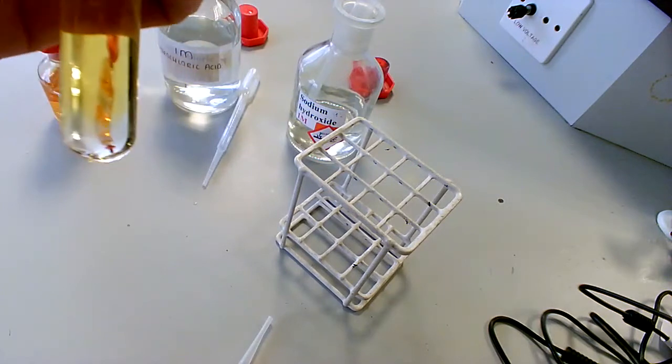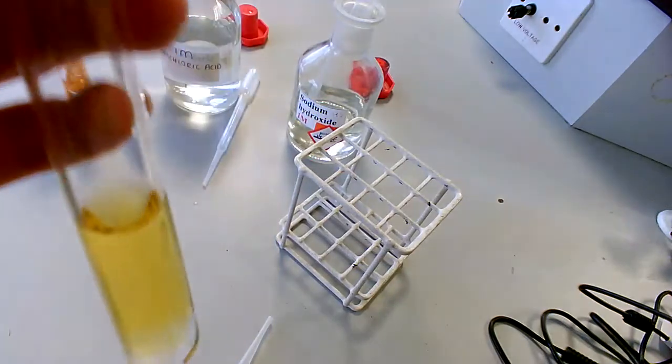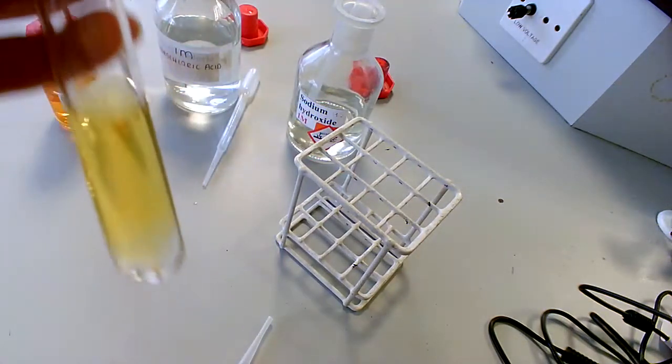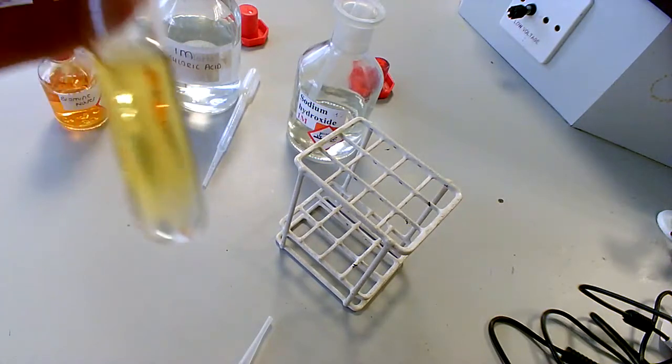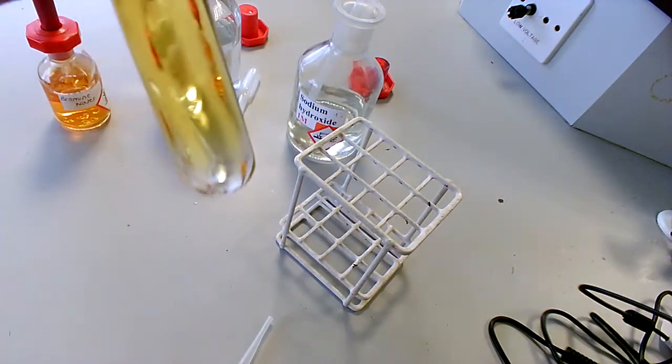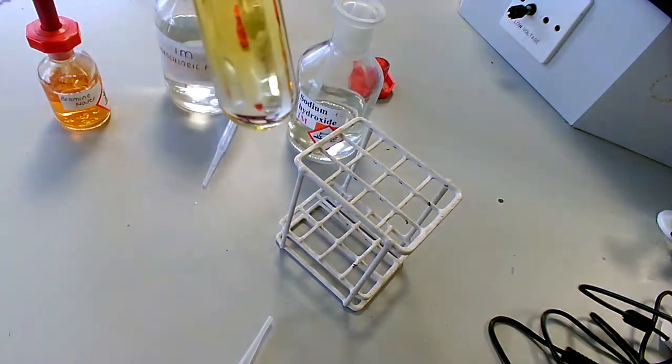So maybe have a think about what's going on here. I added bromine water with sodium hydroxide and it's gone colorless. And then I've added hydrochloric acid and it has turned orange again. So before you move on to the next slide, maybe try and work out what's going on, okay?